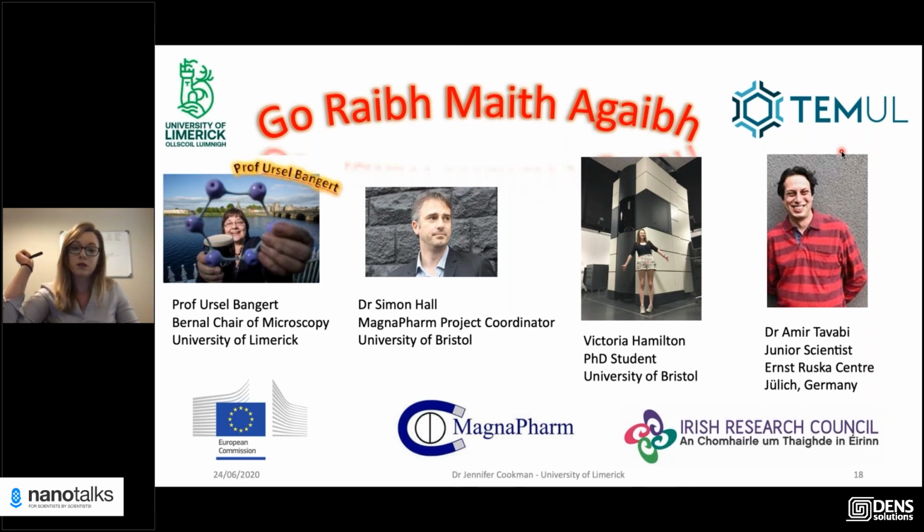So is that right? Just in TEM mode, and you change the positions, right? Exactly, yeah, it's as simple as that. And it's literally just to get a measure of how well the electrons can transmit through the sample. So it doesn't give a quantifiable measure of the thickness per se, but it does give you an idea of the ideal regions of the windows to do the experiment in.